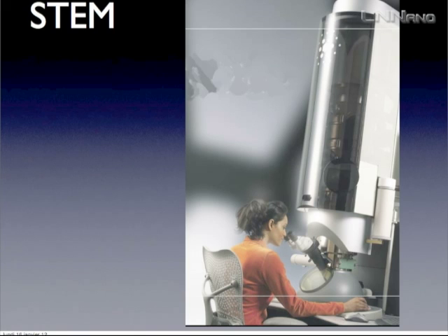And it's kind of funny, because if you think a little bit about that, the gun is here. All of you know that. In a STEM, the gun is here, the condenser lenses are here, this is the corrector, and most probably the objective lens is here. But the point is that this part is very high and may move, so there might be a lot of mechanical fluctuation.